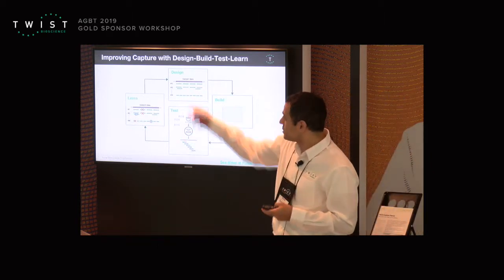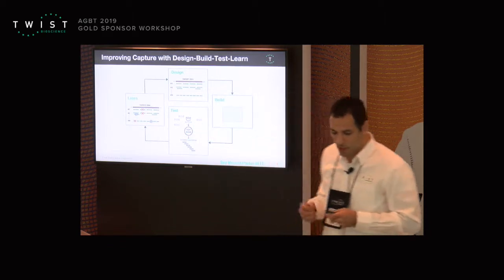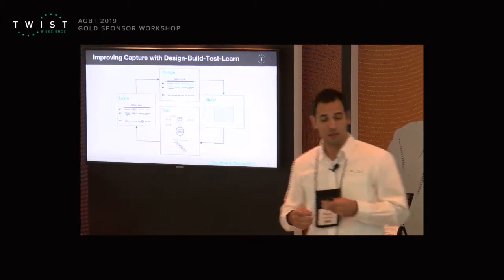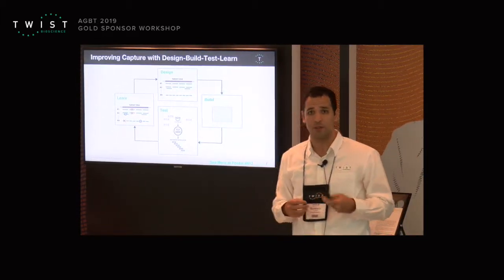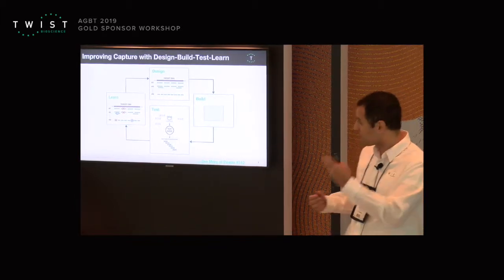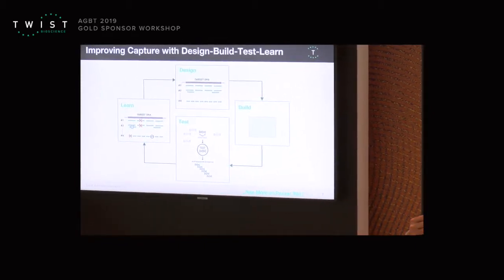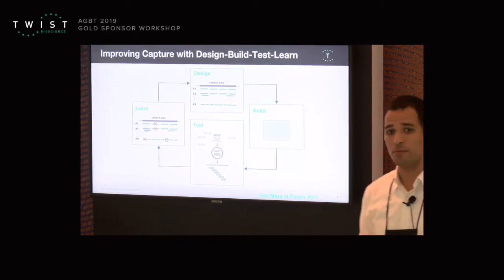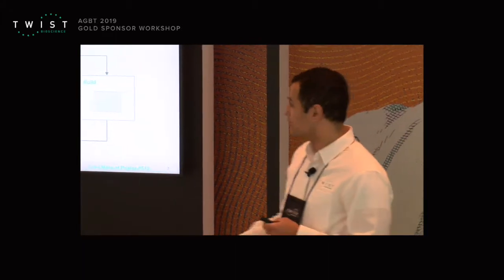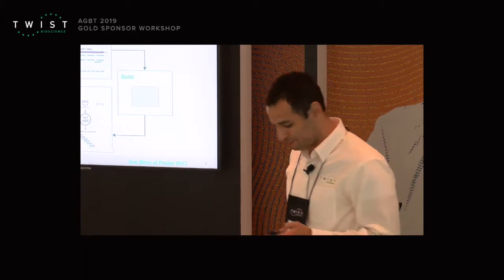Basically what you do is you design a panel of probes, build it, test it, learn from it, iterate. So this iterative approach is powerful when you can iterate more. The speed with which you can run this process is limited by build. And then, of course, the information that we gain through iterations needs to be concise and reproducible. So that, of course, is limited by build and test. If it's not reproducible, you can't learn through iterations, right?